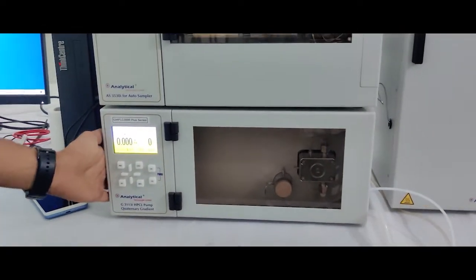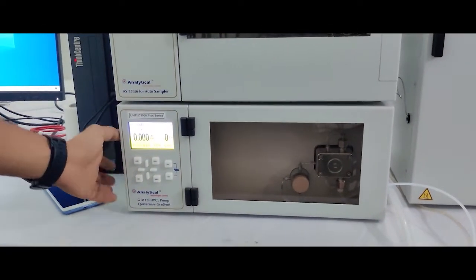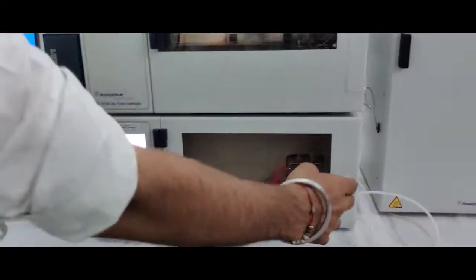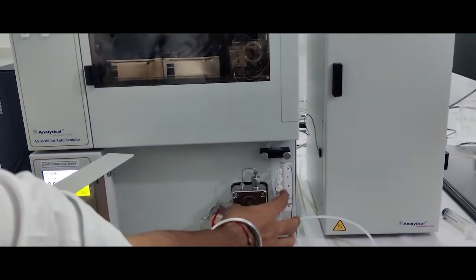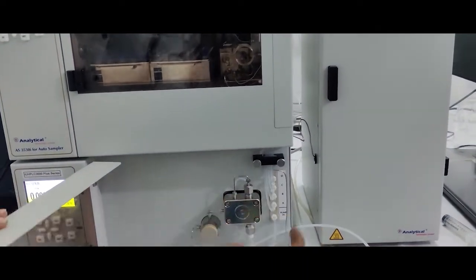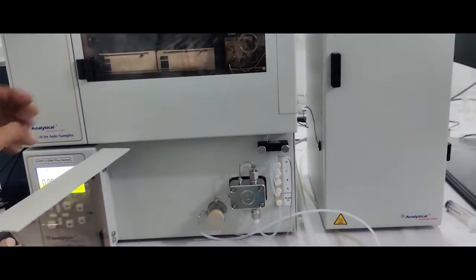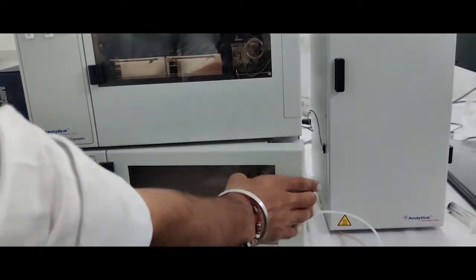This is a pump, quaternary pump, four channel: A, B, C, D. This is a quaternary pump.